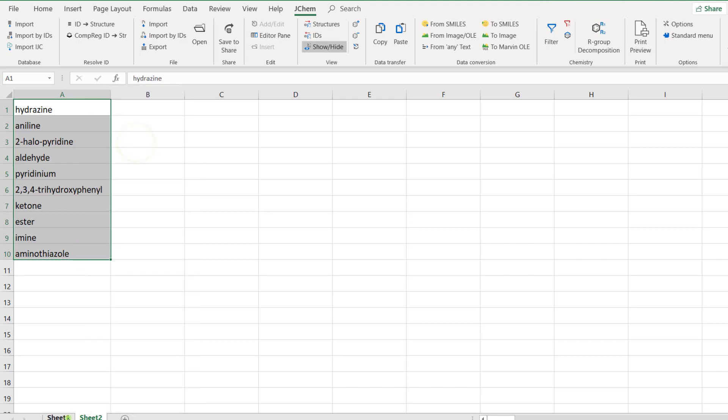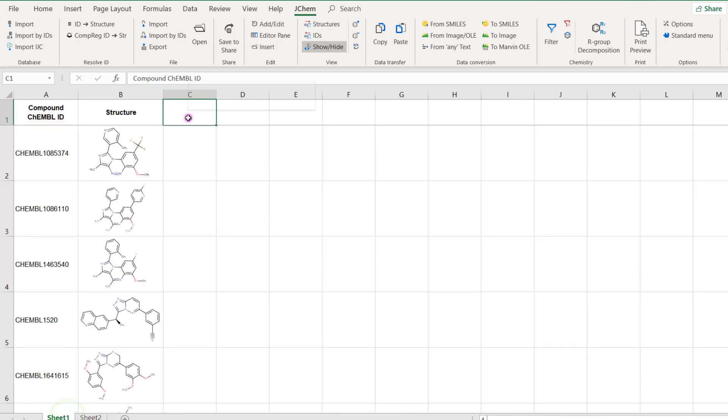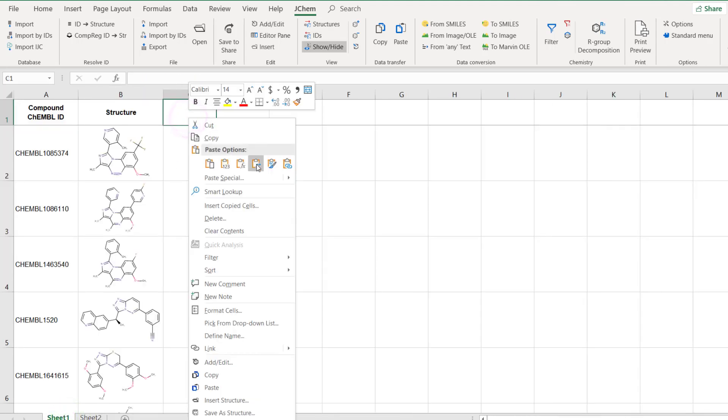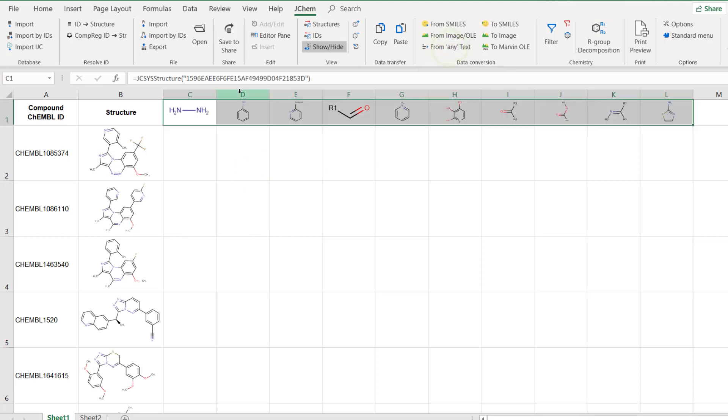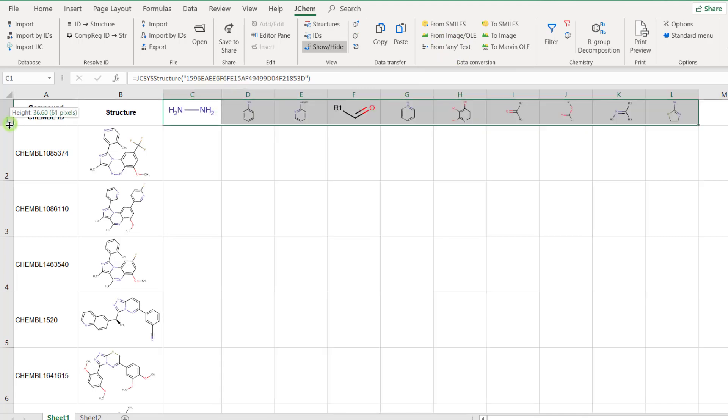Optionally you can convert the names to see the structures themselves using the from any text button. As a next step let's check whether the first compound contains a hydrazine unit.